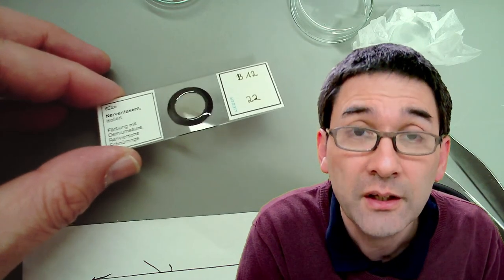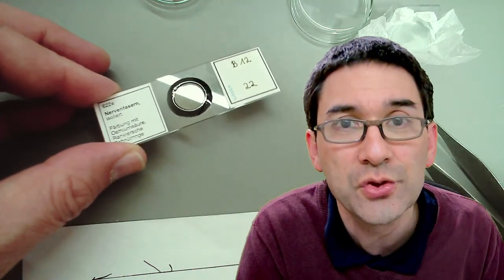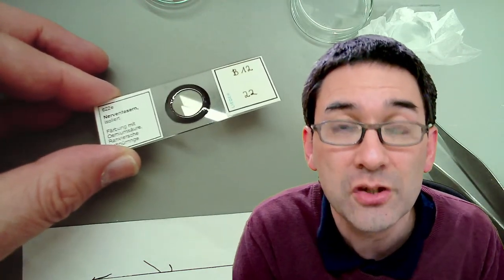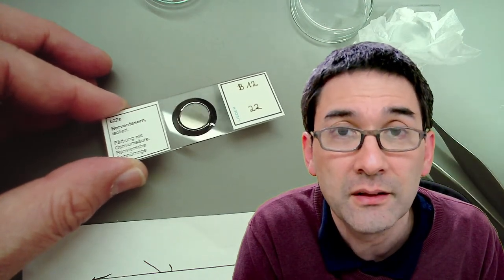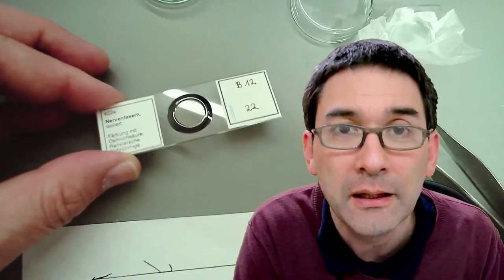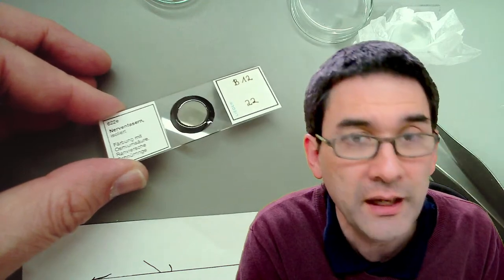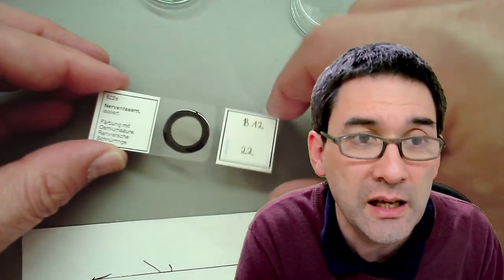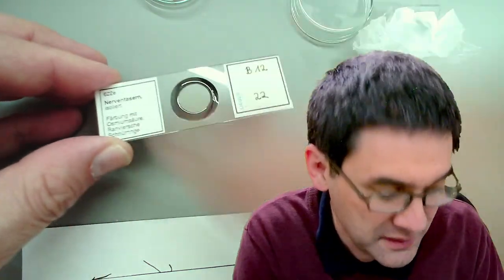Why do you do that? You do that because the mounting medium that was used does not dry completely. It remains semi-solid. In order to prevent the moisture from going in and out and destabilizing the whole thing, you apply a ring around it. And for that, if you want to do it efficiently and nicely, you need a round cover glass, because you'll be spinning the slide and can apply it.